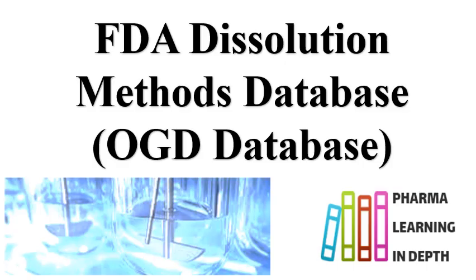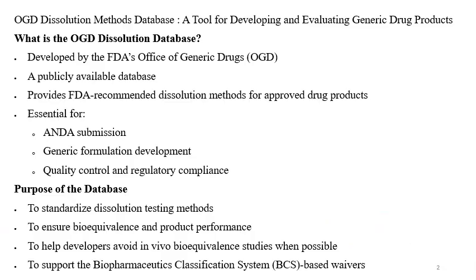this database. I welcome all the viewers to this very informative topic on the OGD dissolution methods database. OGD is a tool for developing and evaluating generic formulations or generic drug products. Also, you can refer to this database for making novel formulations, or you can use it for making hybrid type of formulations. It can guide you to start the method development.